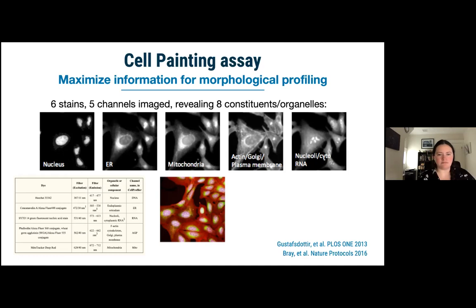Does it really matter that the scaling has been done or not? And as an example, let's say you want to study an organelle such as endosomes and lysosomes. If there is some kind of perturbation, if they are getting enlarged versus getting tiny, would the texture feature really be able to detect that?